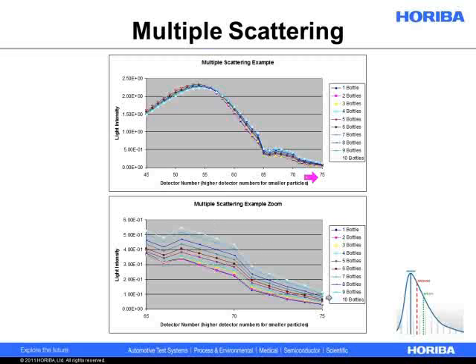And what we see here is that the 9th and 10th bottles, the teal and very light sky blue, are scattering much more light on these wide-angle, high-number detectors than the 1 and 2 bottles. This fits the expectation, so it's another clear indicator that we're starting multiple scattering.